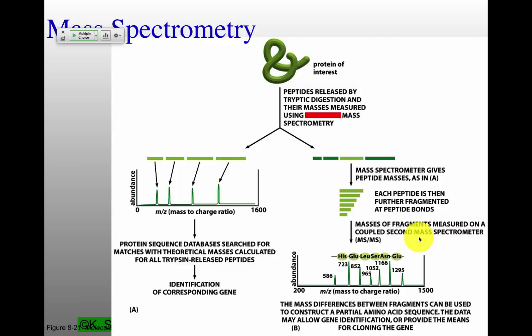So identifying a particular protein is great. And the other thing, sorry, I forgot to mention this, is that this only works in terms of identifying these peptides if you have the information of all of the proteins that could be made by the particular cell that you're looking at. And since we've got all these genome sequences, we've got the human genome sequence, we've got the E. coli genome sequence, we've got the Sulfolobus genome sequence, one of my favorites, and in looking at all of those sequences in nucleic acids, you can now predict all the proteins that are made and all the peptides that you would make, and then do the comparison.